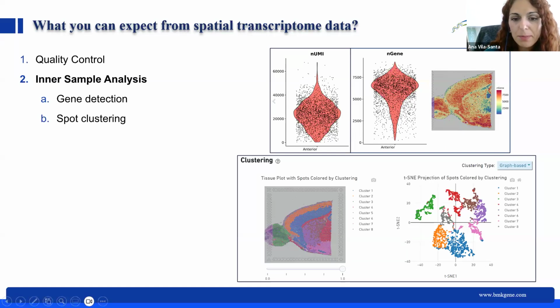So as you can expect, for example, the cluster in orange is very close together on the outer layer of the tissue, and then we have a layer of blue, etc. This again goes to that idea that the clusters of transcriptionally similar cells should correspond to structural information within the tissue.